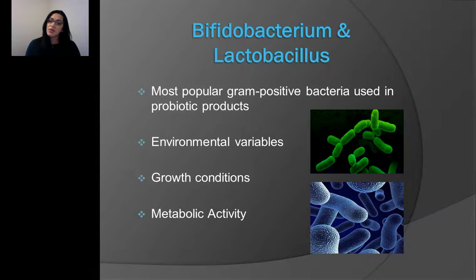And also, in some cases, we will have to duplicate it in 4 plates, where you can modify the incubation process for each of them. This way you would obtain a more accurate result. So this plating method is not that accurate when it comes to determining the metabolic activity and also physical characteristics of these different species.